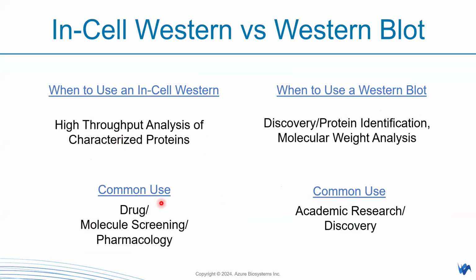One example that I normally use will be, let's say you have cancer cell lines, can be human cancer cell lines, and you want to test a series of anti-cancer properties, by increasing dosage, and not only the increasing dosage, but different types of compounds as well, because you need to do it in a large quantity.